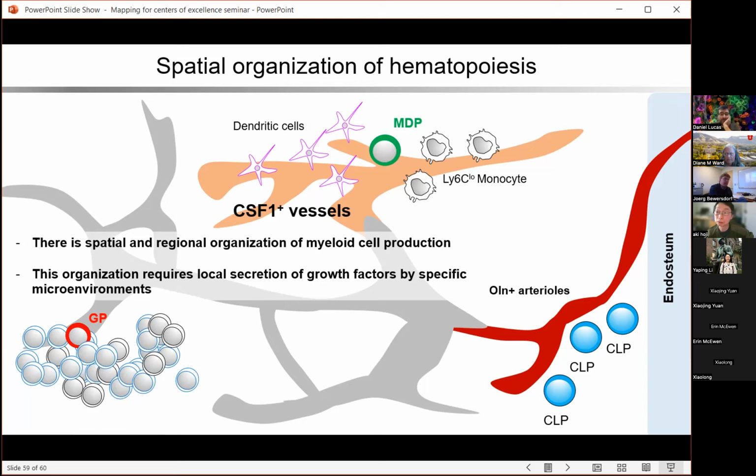That's optimization. So you're just staining for cell surface markers? We've mostly focused on cell surface markers because our interest is where the cells are and how they are interacting with each other. We've imaged reporters for transcription factors, and those work very well. Oh, okay. In this setting, that's very feasible.